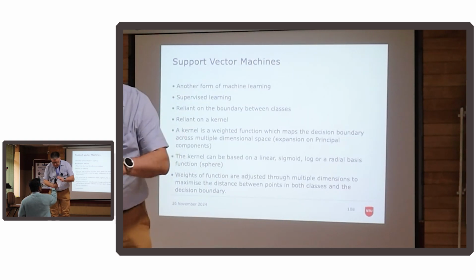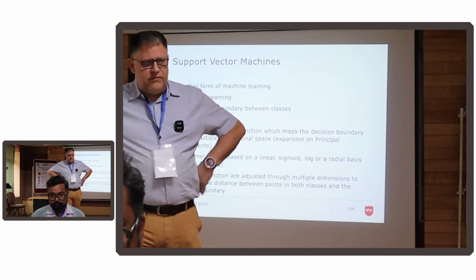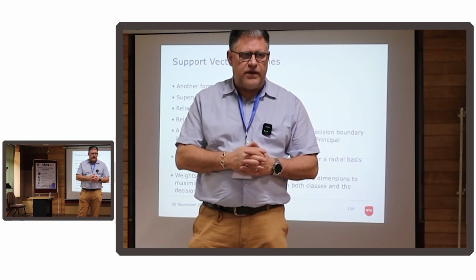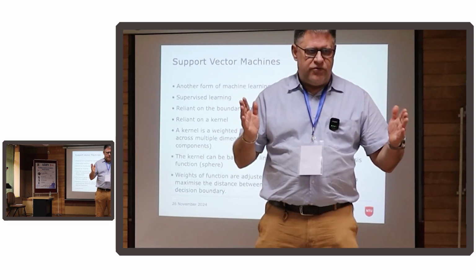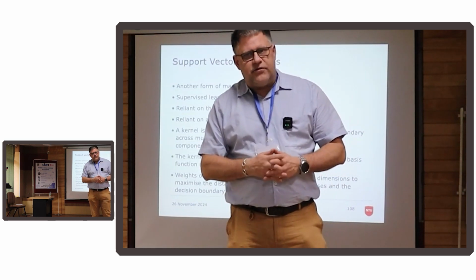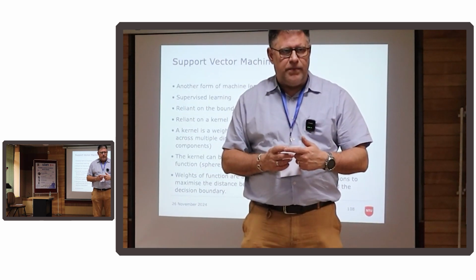So you want to find out, you've got a data set and you want to find out new features of importance about that data set. Yeah, but it's a high dimensional data set or it has a large number of variables, you just don't know how they relate to the thing of importance. Yeah, so I can show you some more of that, and I will show some more of that coming up.